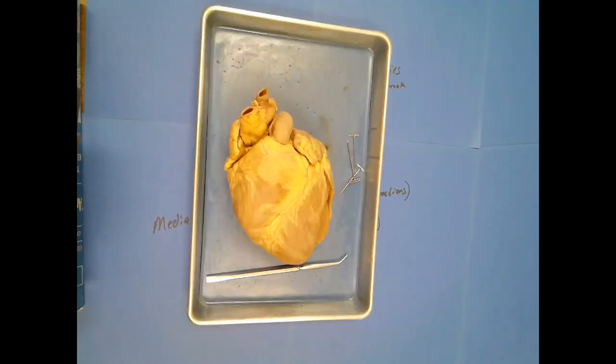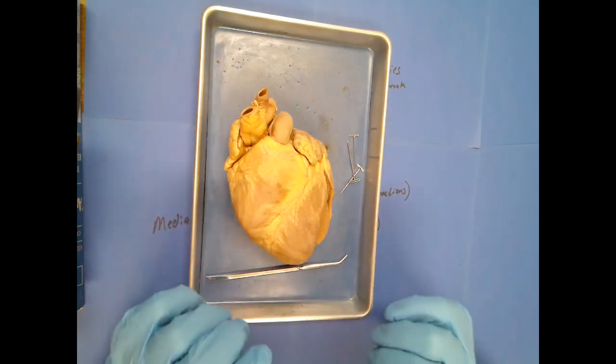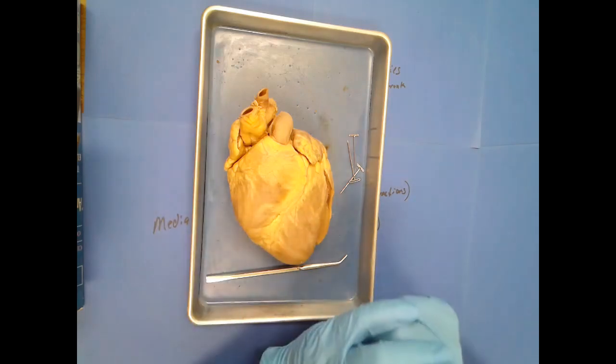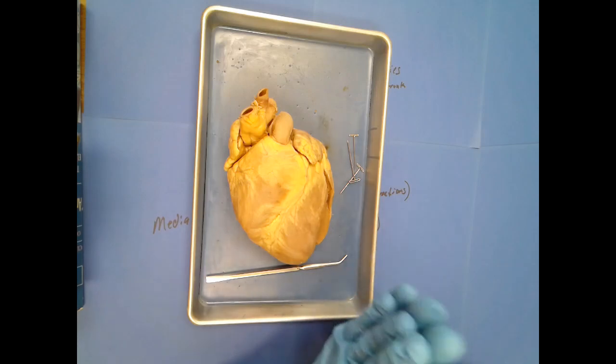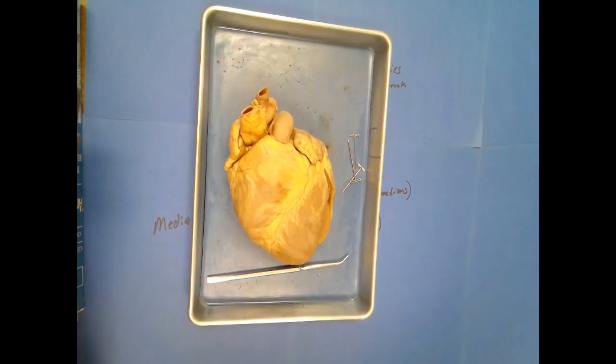All right, so for this particular lesson, I want to focus on the actual hearts themselves, and I've got a few that were dissected that I'm going to show from multiple perspectives. Since my students in the online platform can't do this in person, this is the best way I can think of to bring this dissection lab to you.